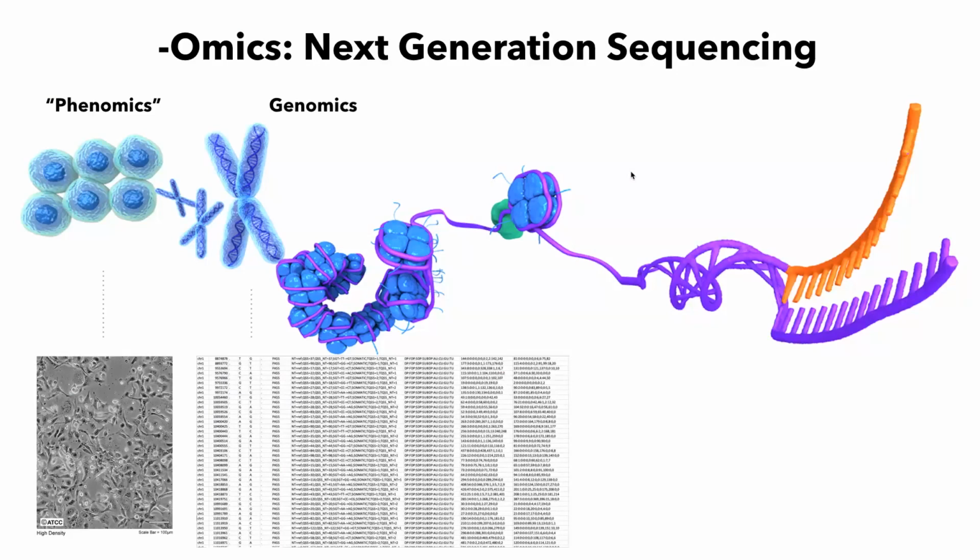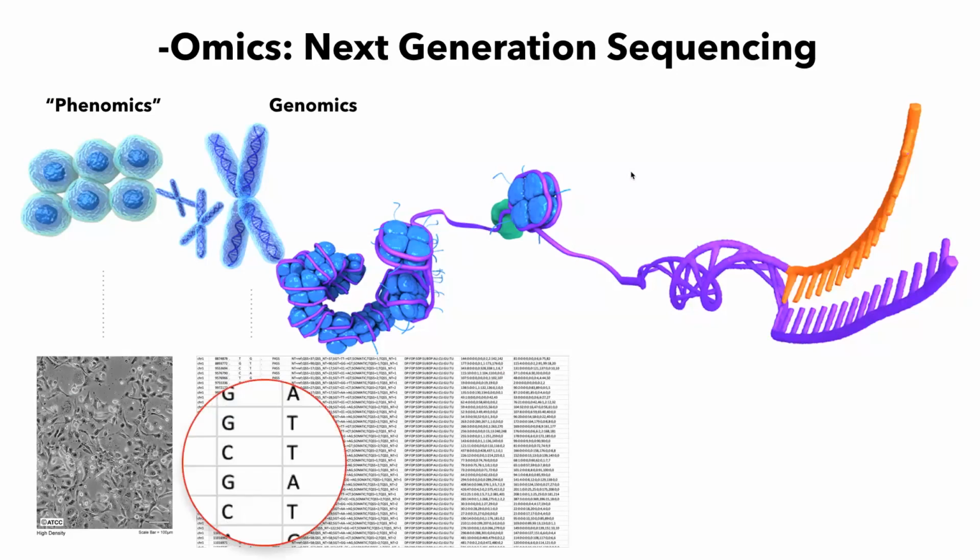So what is genomic data? Those sequences will have individual letters in the read that we are looking at and in the reference. By looking at the difference between the read and the reference, we can identify several different variations, for example substitution, insertion, deletion. So we can look at a variety of changes in the sequence.